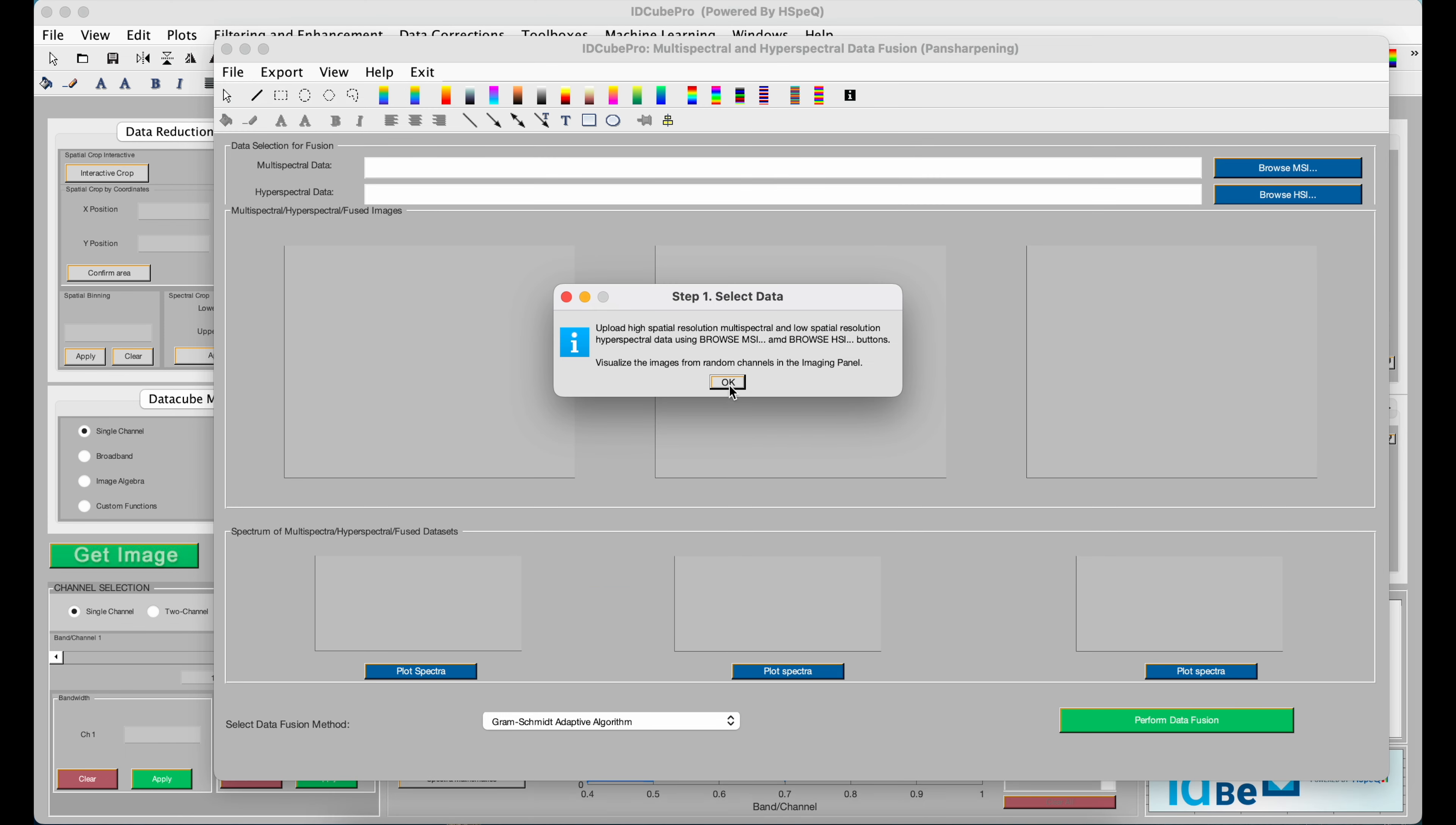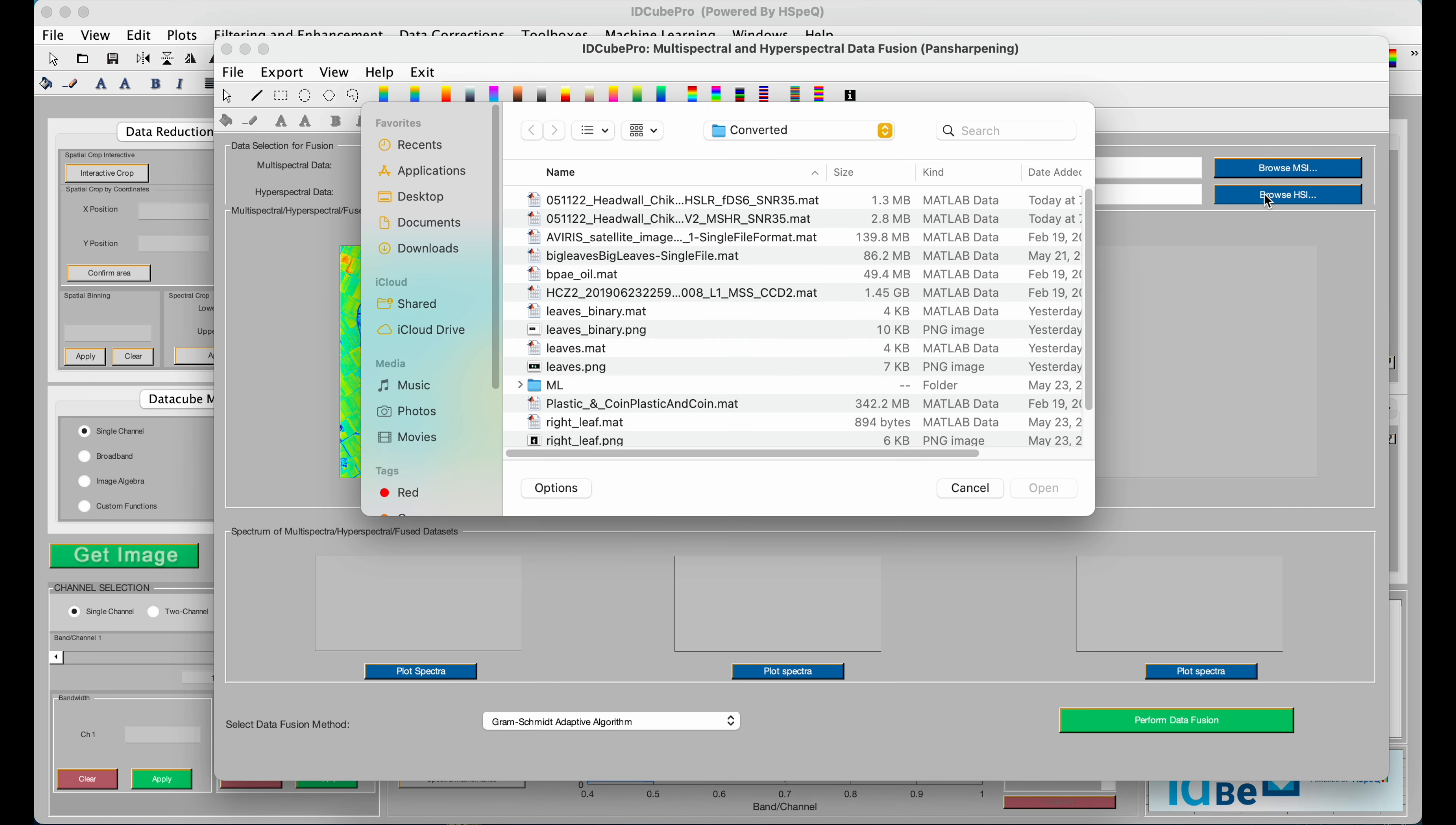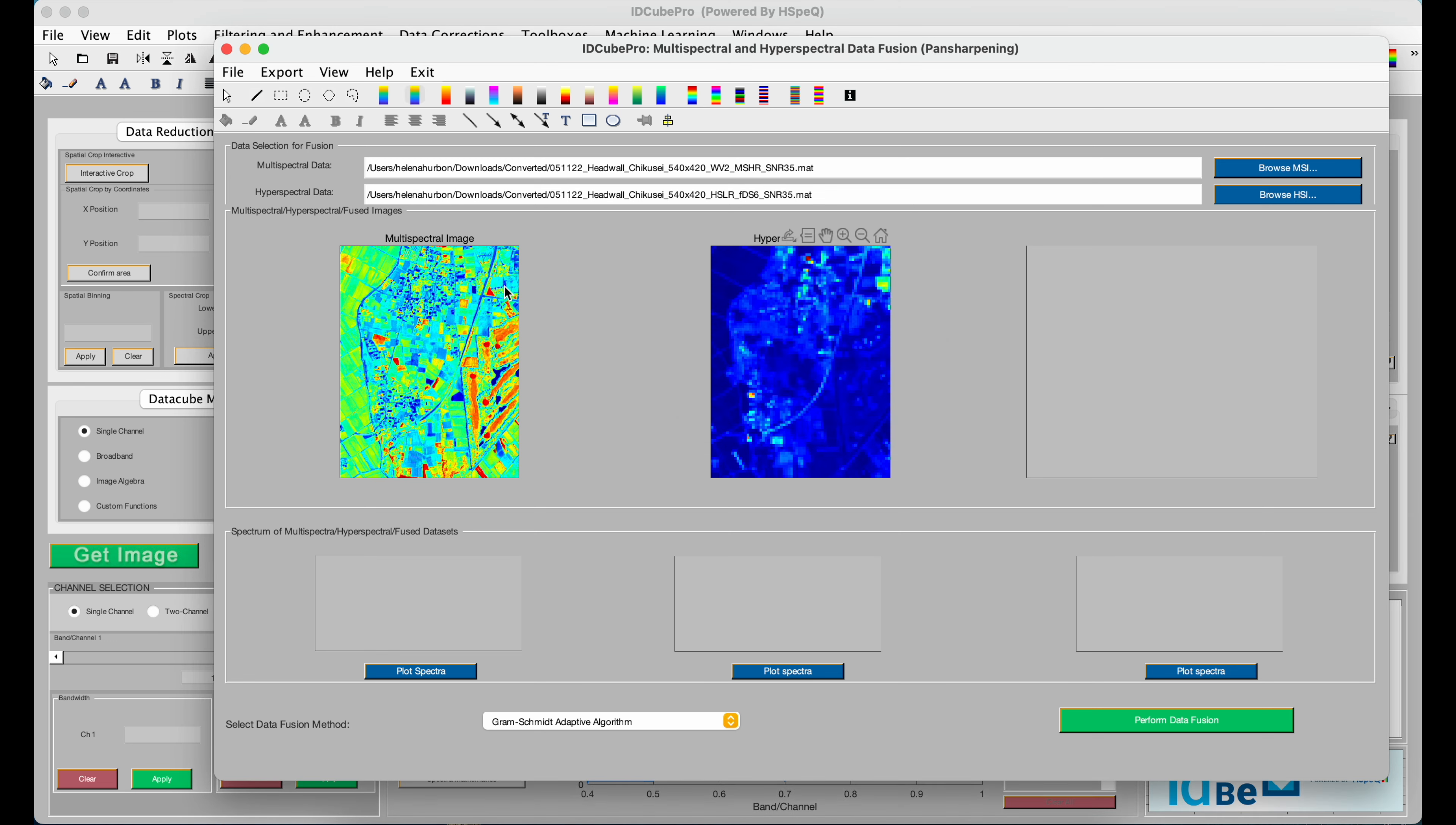You'll then be prompted to choose the multispectral dataset, and then choose the hyperspectral dataset. It displays both of them, the multispectral one here, the hyperspectral one here.